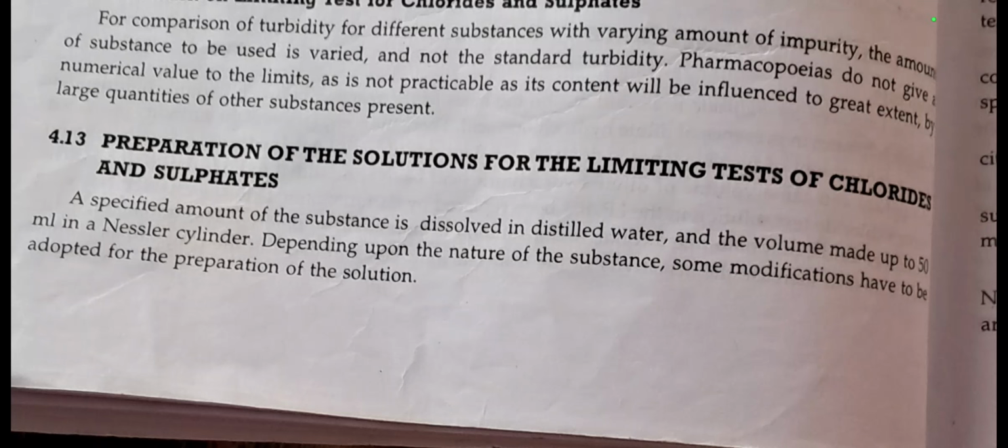My dear student, this session will briefly cover the preparation of the solution for the limit test of chloride and sulphate. If we are going to perform the limit test for chloride and sulphate, some modifications have to be adopted for the preparation of the solution. Let's see in brief.